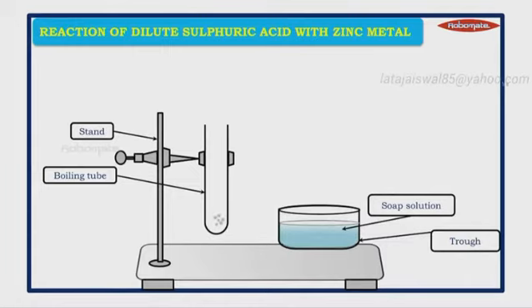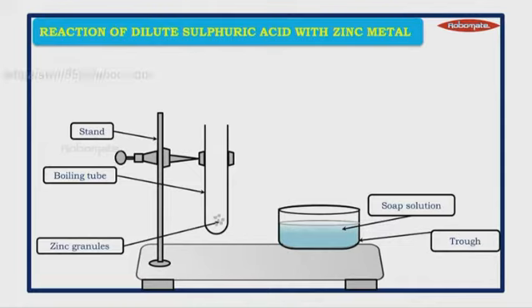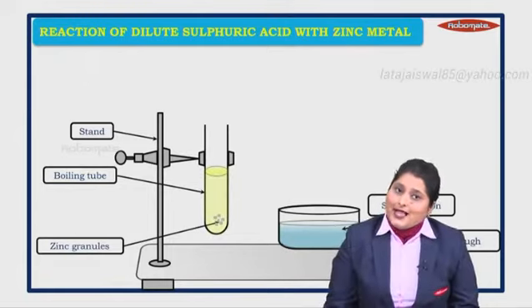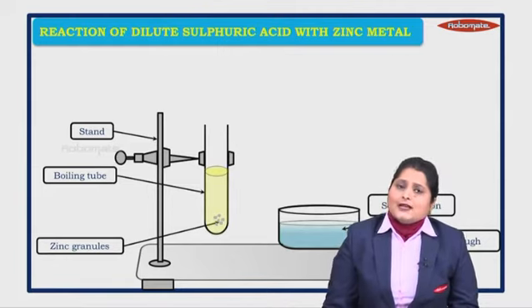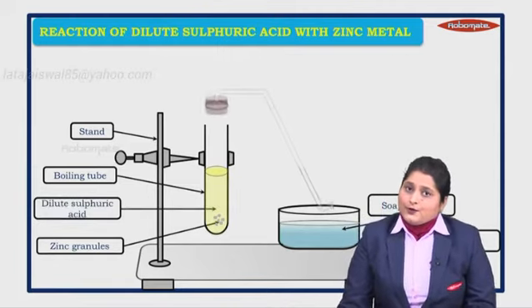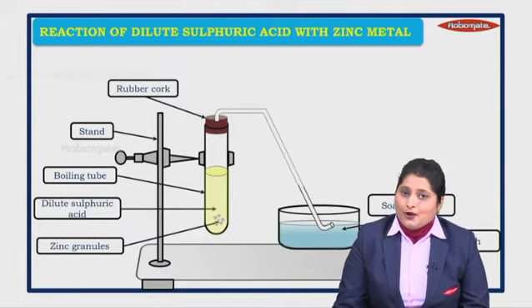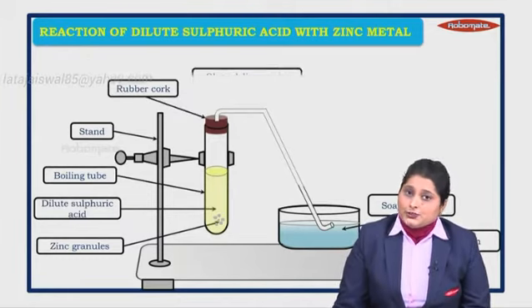Inside the test tube we take zinc granules, as we are learning the reaction of dilute sulfuric acid with zinc metal. Then we are going to add sulfuric acid. After adding sulfuric acid, we cover the test tube with the help of a rubber cork, and inside the rubber cork there is a delivery tube.